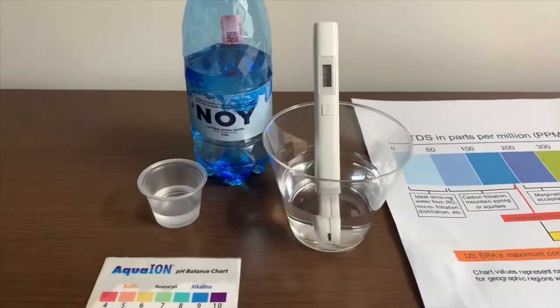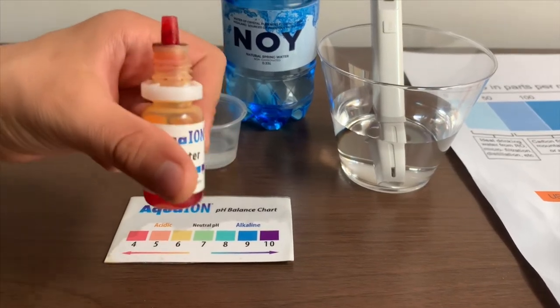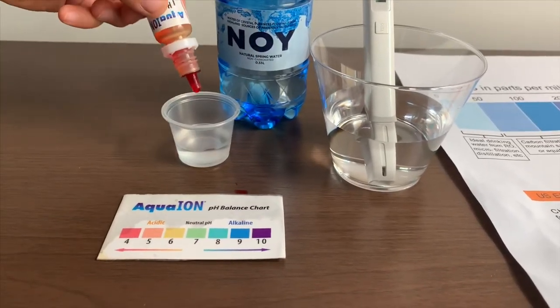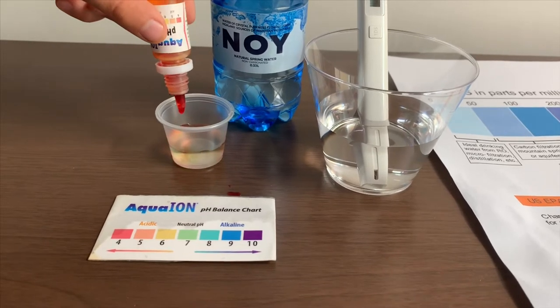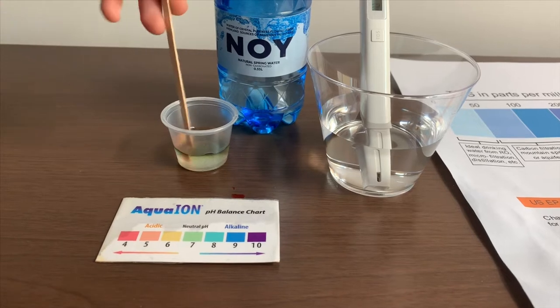Now let's test the pH level. If you want to buy this pH tester, check the link down below. Only do two drops. Let's stir it a little for a better result.